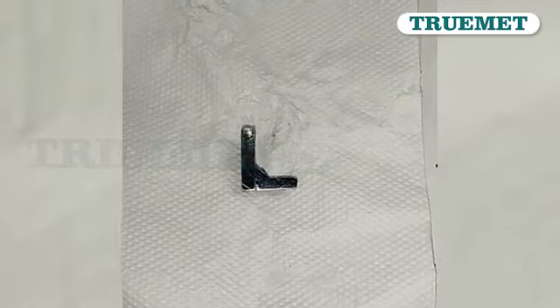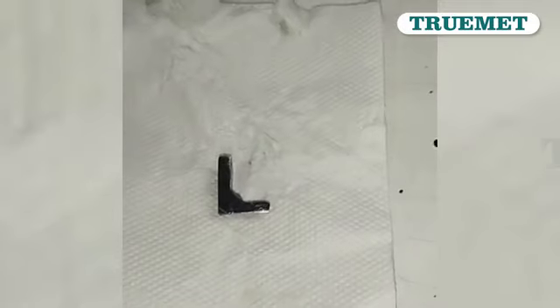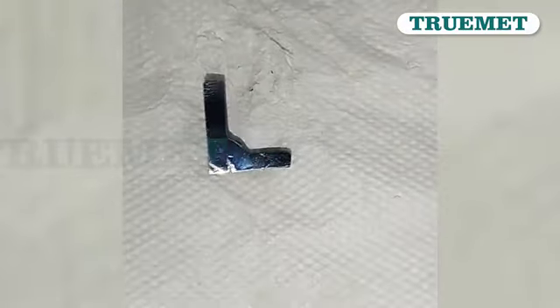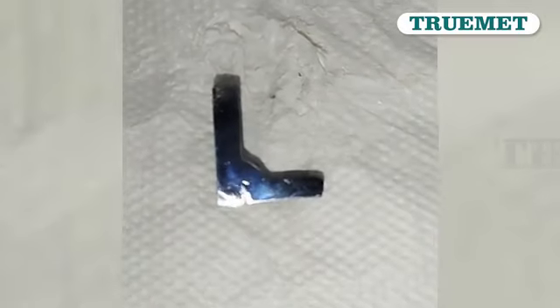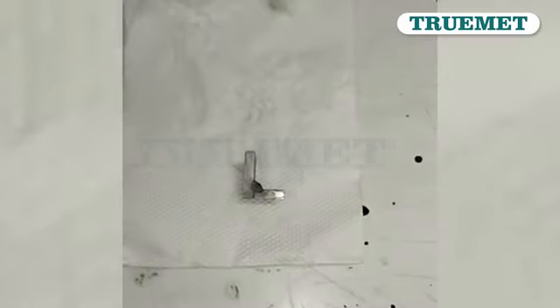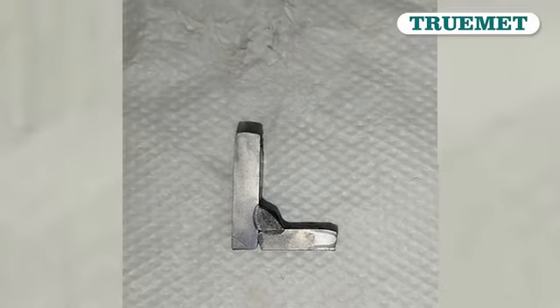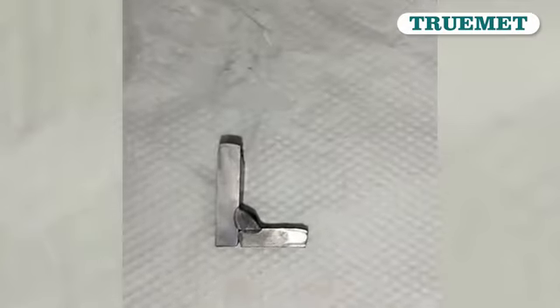Now we are moving to our third process, that is etching of the component. For etching we are using nital 3%. So we are going to etch the component and show you what happened after etching. We etched the component using 3% nital, and this is the final product.